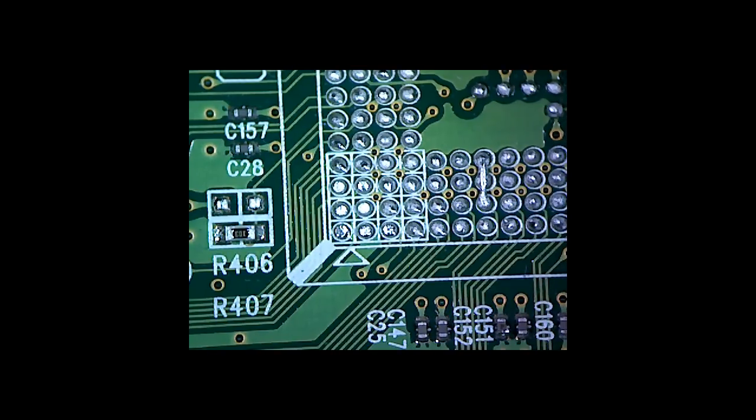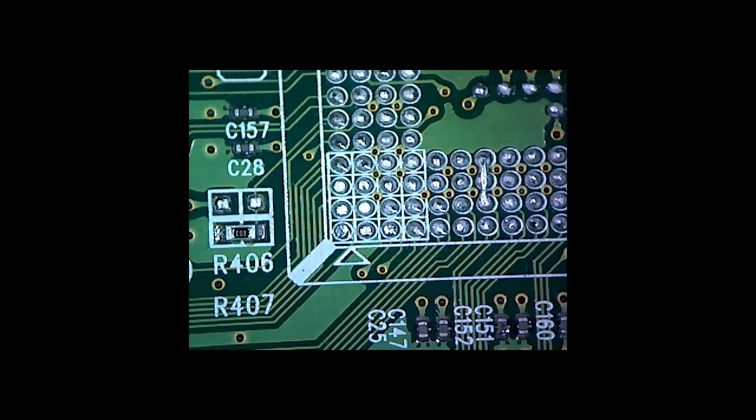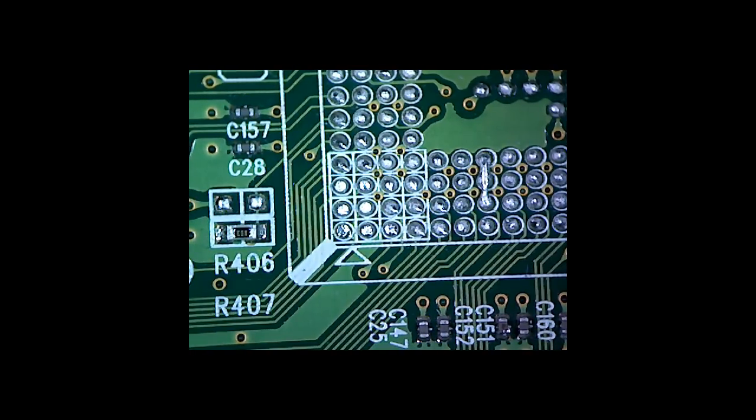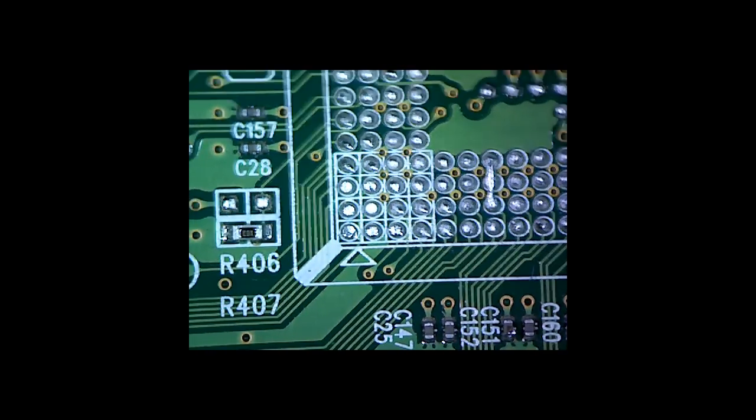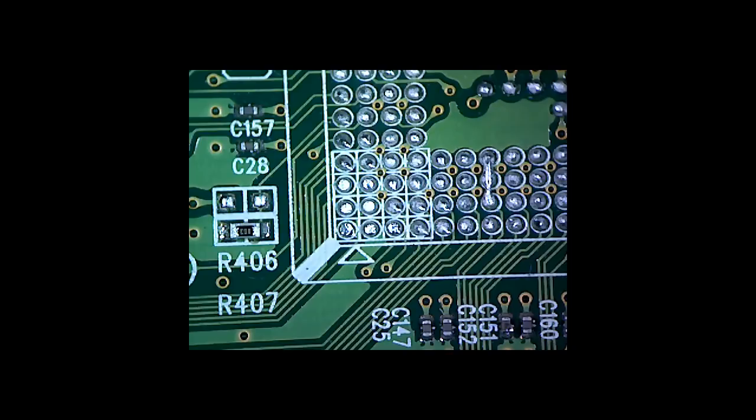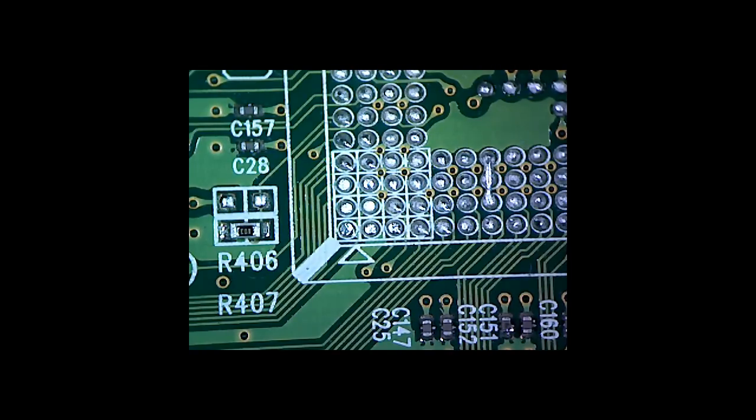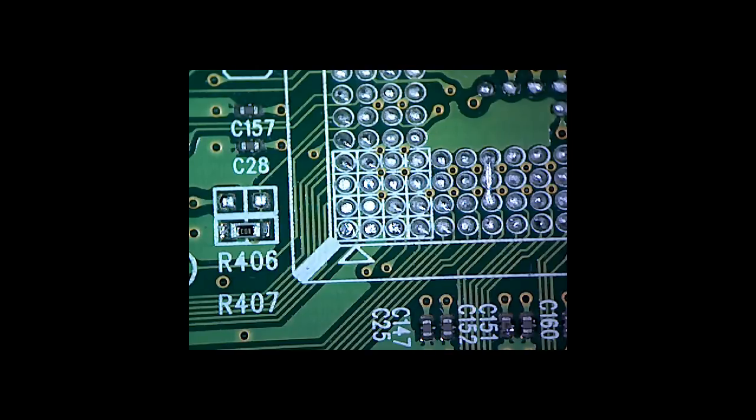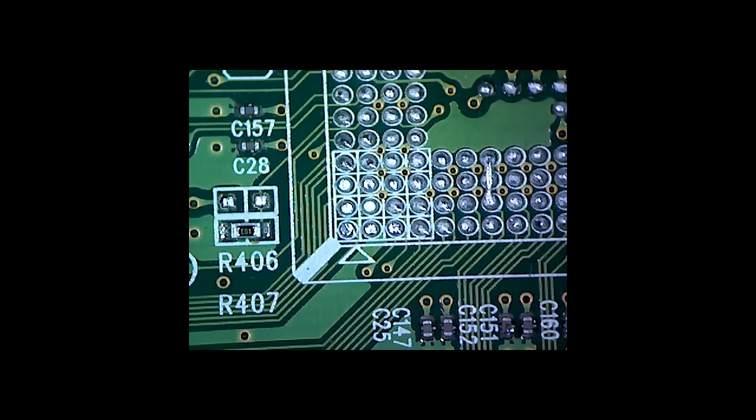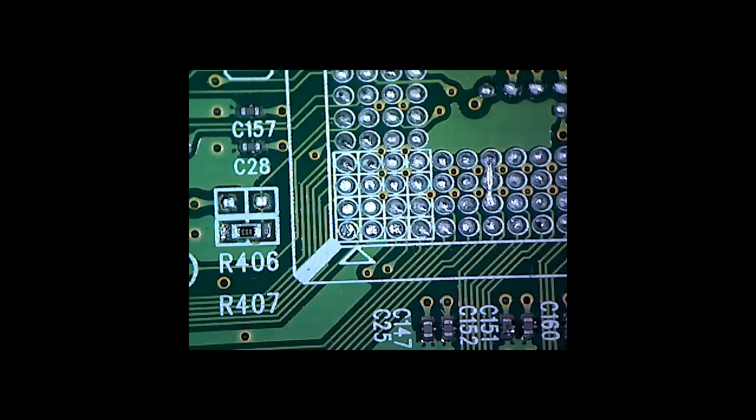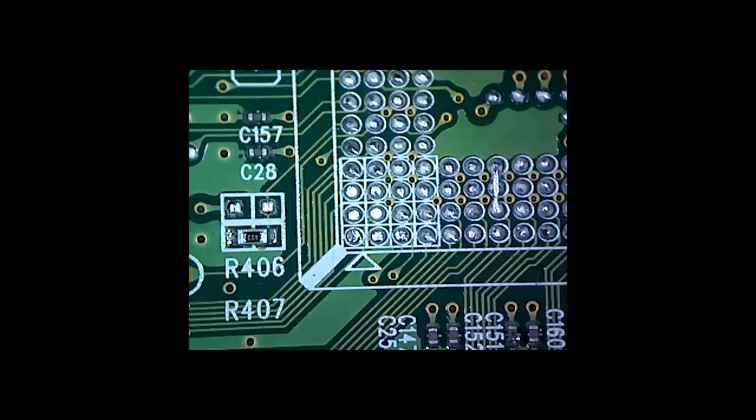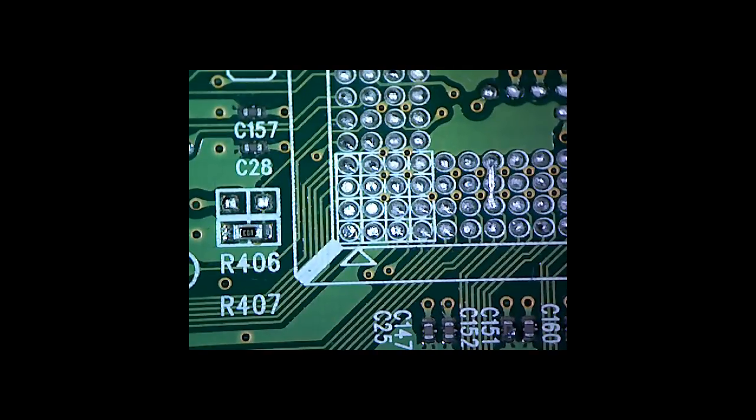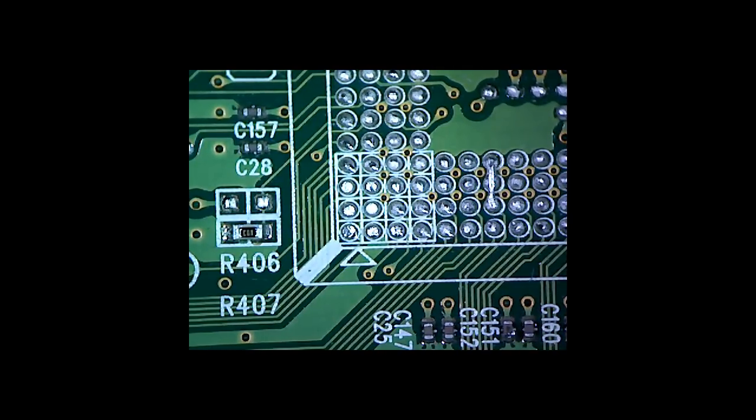Hi guys, this is the Mantis Elite with camera. The capture software is a demo version of amcap. Vision Engineering supplies a version of this. The software is not fantastic but it does the job and it's free.